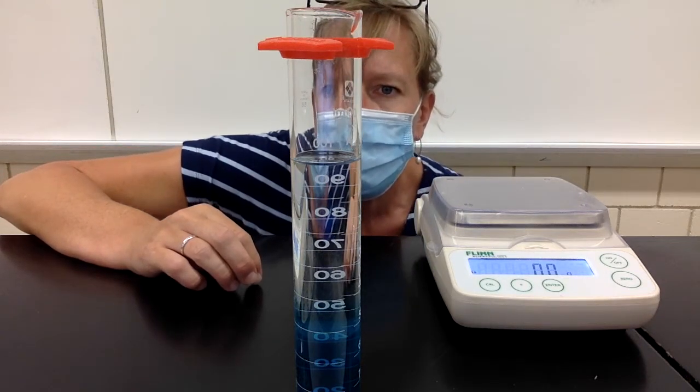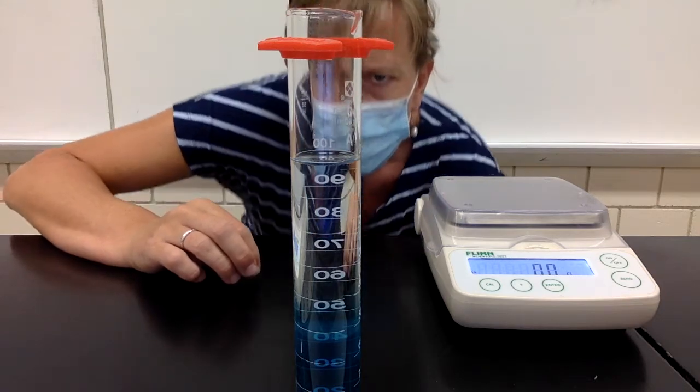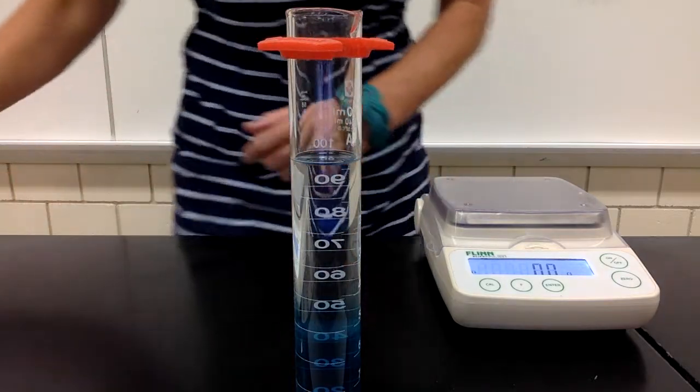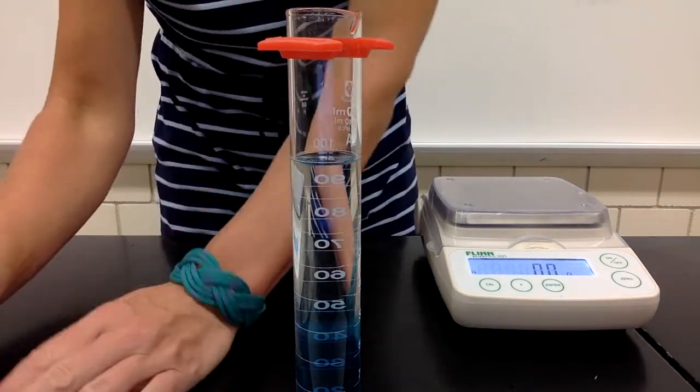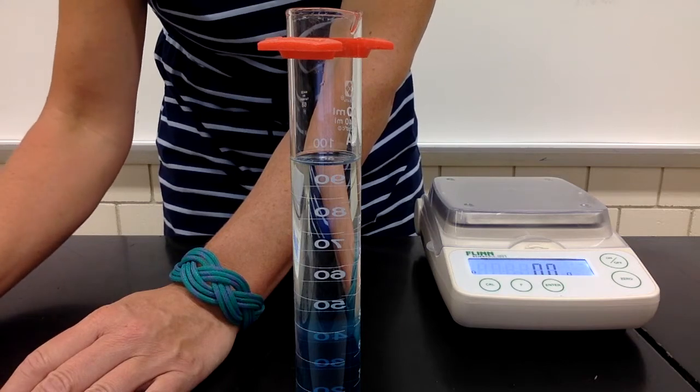It looks like it's right on the 100. Actually, yeah, it's right on the 100. So I'm going to call that volume before we mix them 100.0 milliliters.